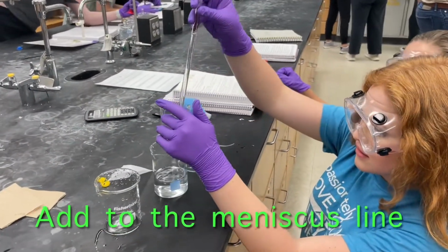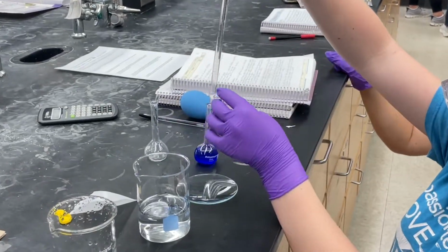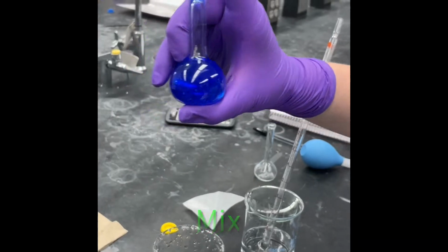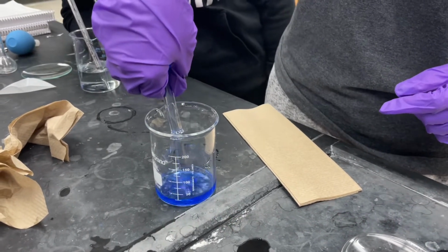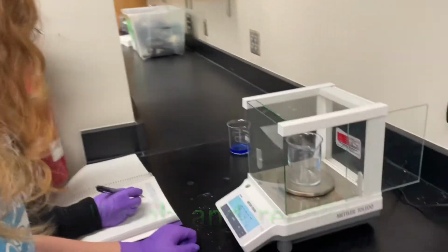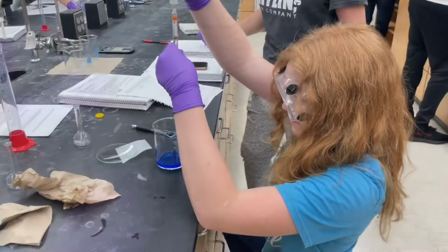Then, we took the flask and added more water to make it equal to the meniscus line. Then we had to mix it thoroughly. After mixing, we poured it into the beaker. We had made our stock solution. Then we weighed it. We got 137.095 grams.